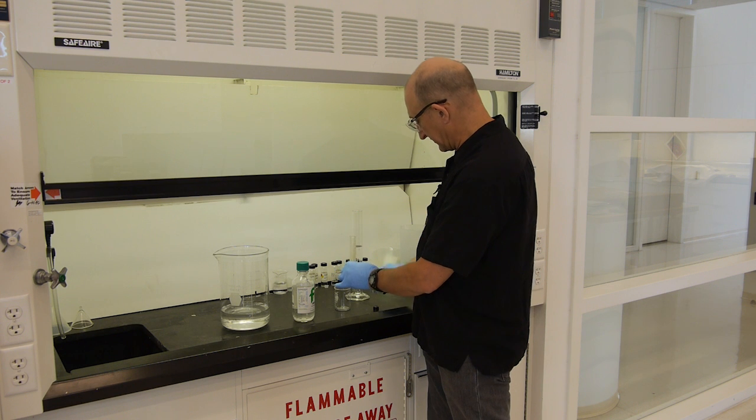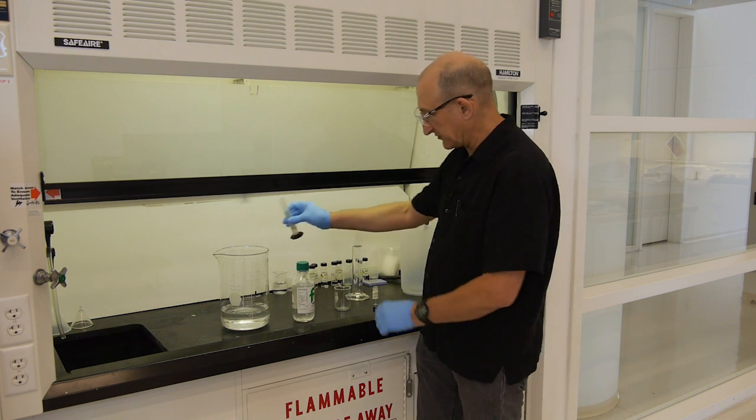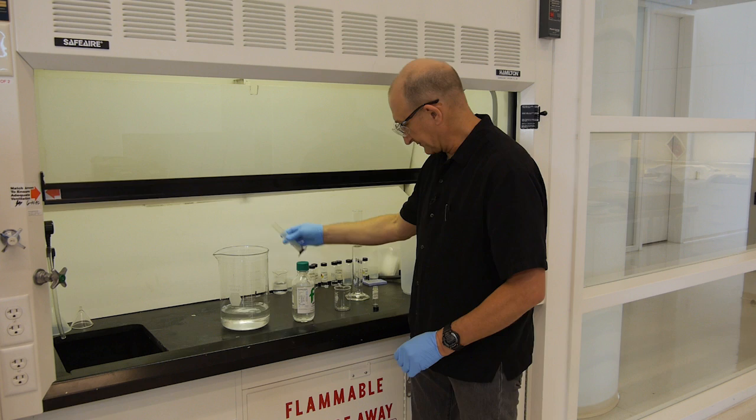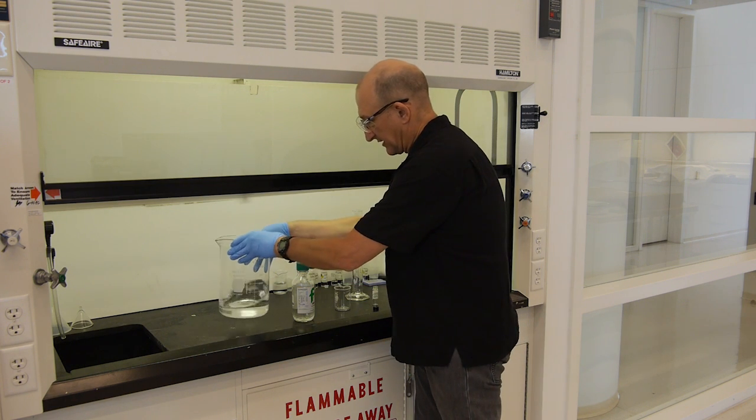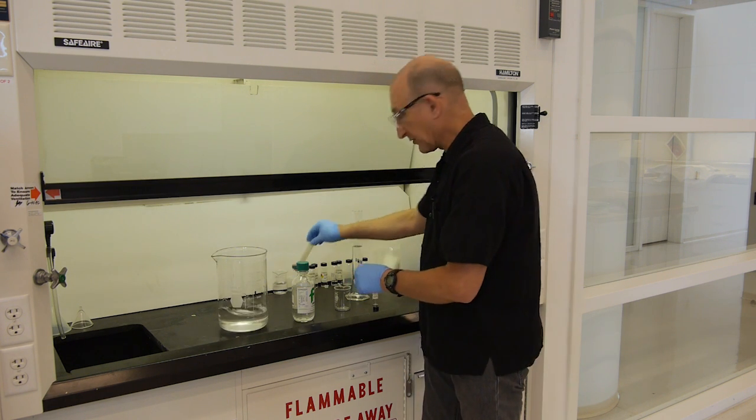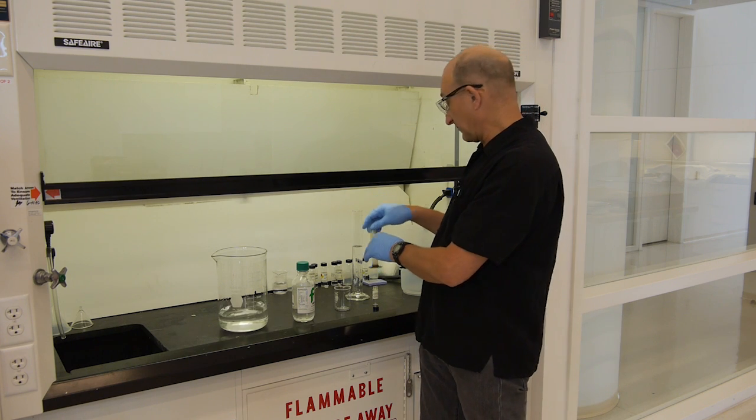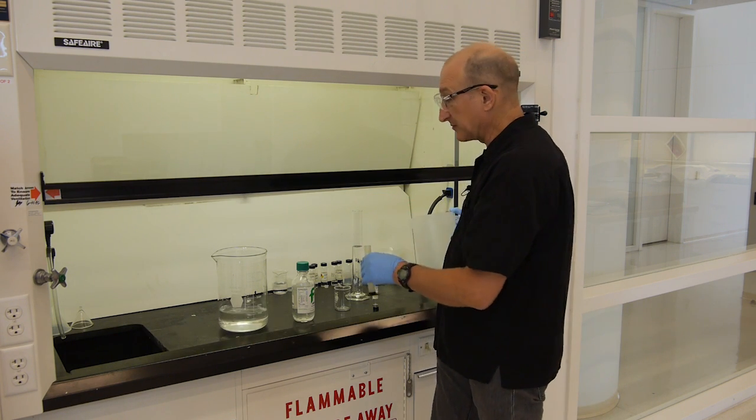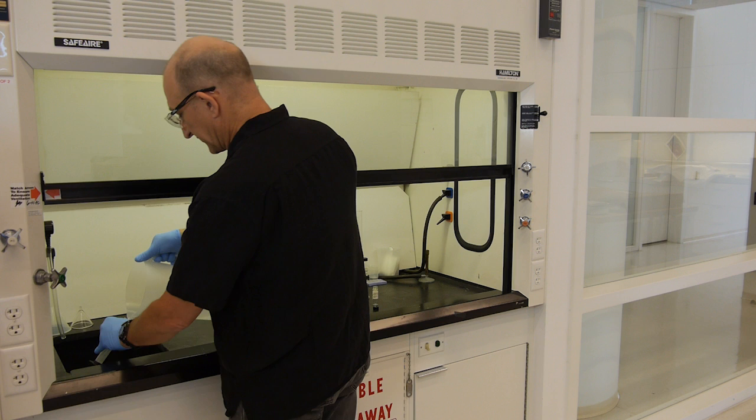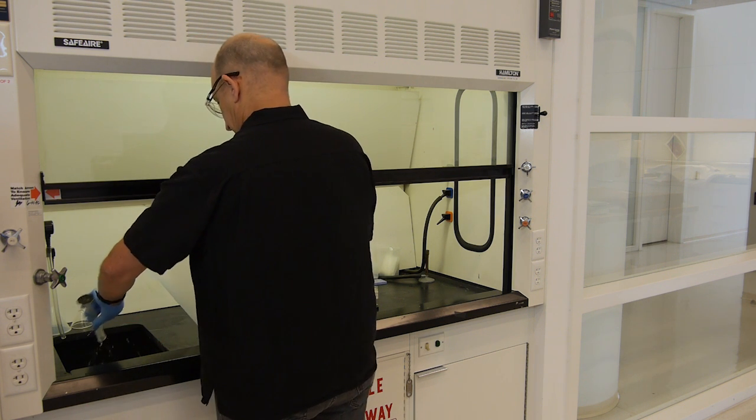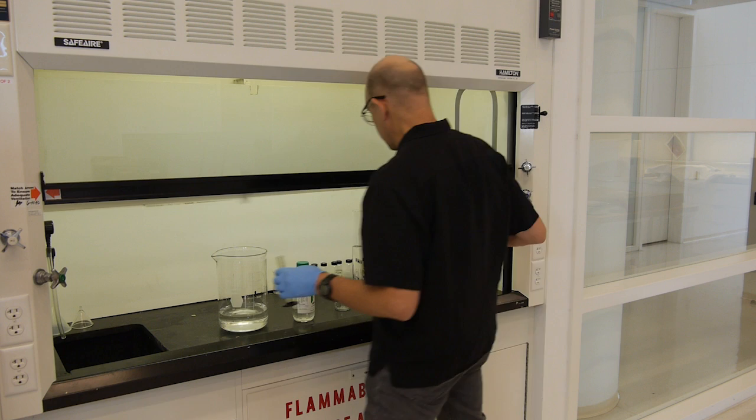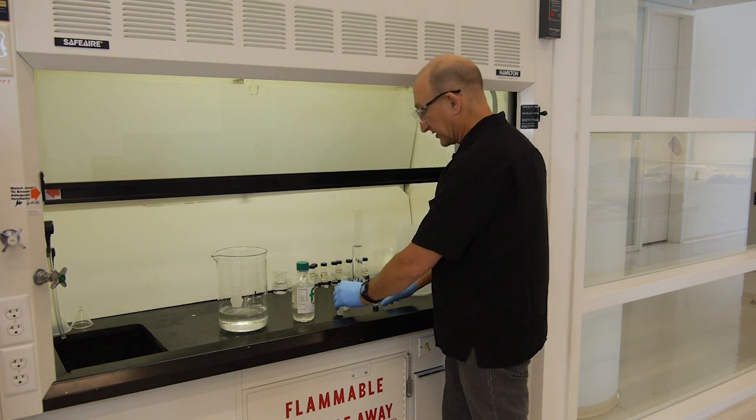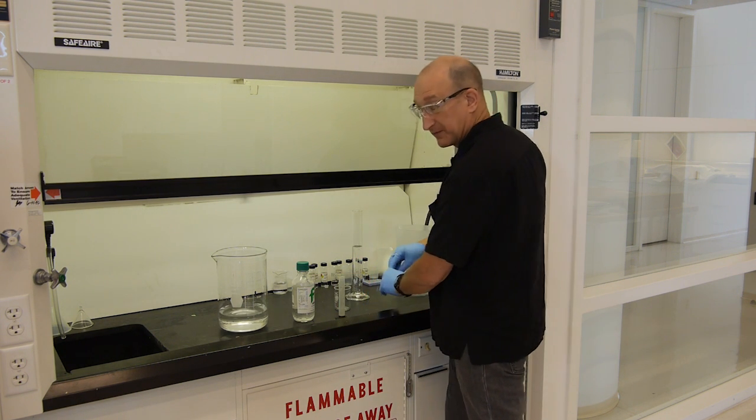So there's 10 milliliters of glacial acetic acid, and that's ready to go. Now we also want to make the 10% ammonium hydroxide solution. So we'll just rinse this out. Obviously, we don't want the acetic acid mixing with the ammonium hydroxide in concentrated form.